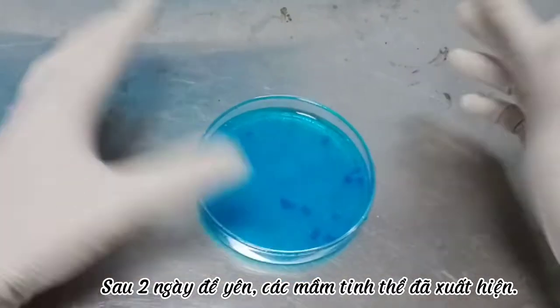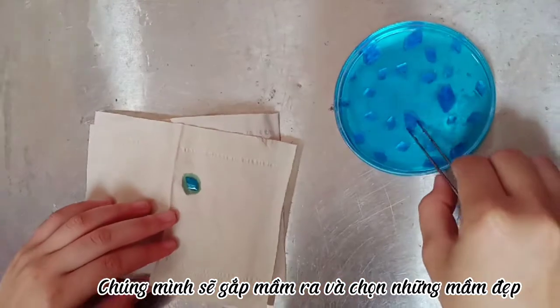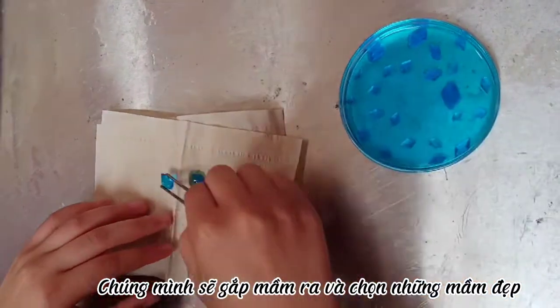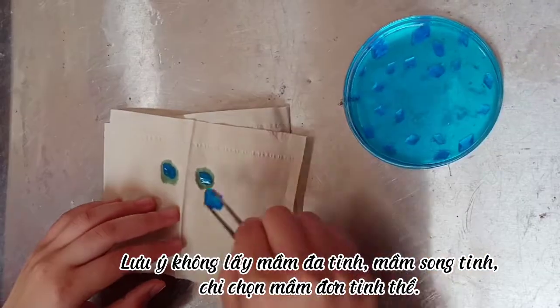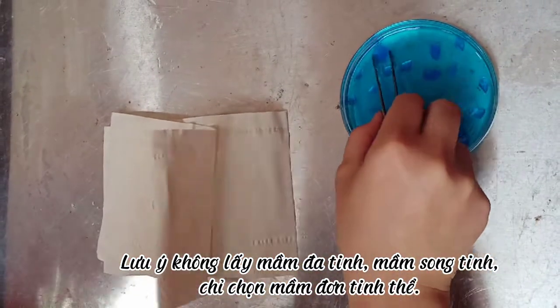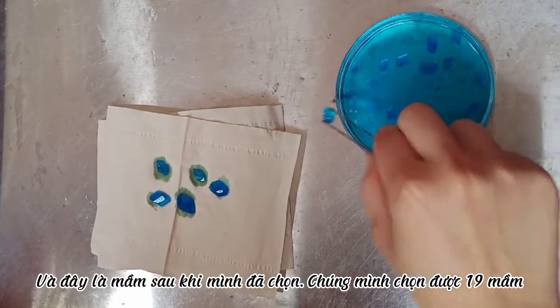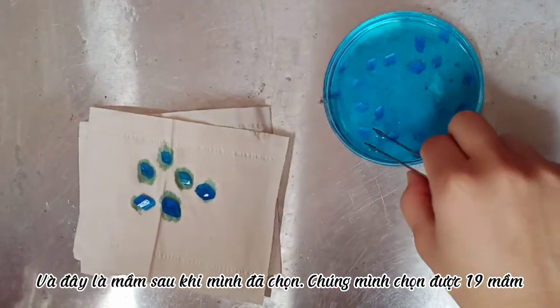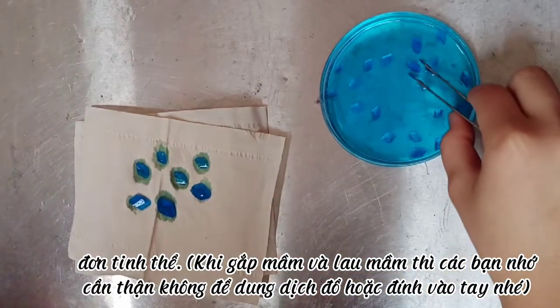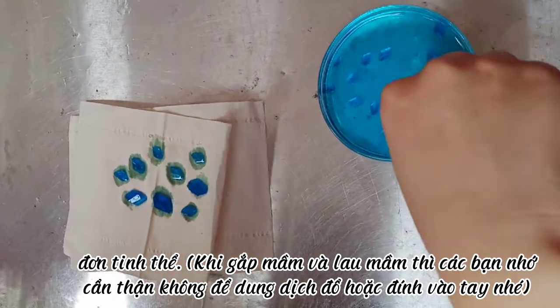After 2 days of letting stand, we saw crystallization appear in crystal sprout. Now, we'll start picking out the sprout to choose the beautiful ones. Please note that we do not take polycrystalline seeds, twin seeds, only standard structural monocrystalline seeds. And this is the sprout that we chose. Our flower uses 19 sprouts. When picking and wiping the sprout, be careful not to let the solution spill or stick to your hands.